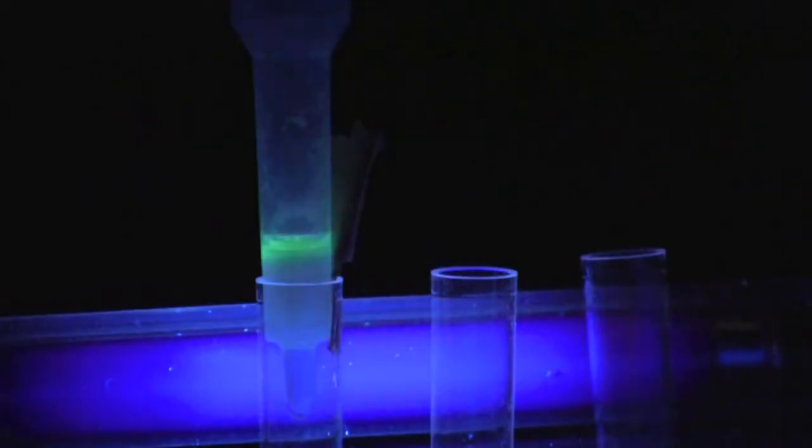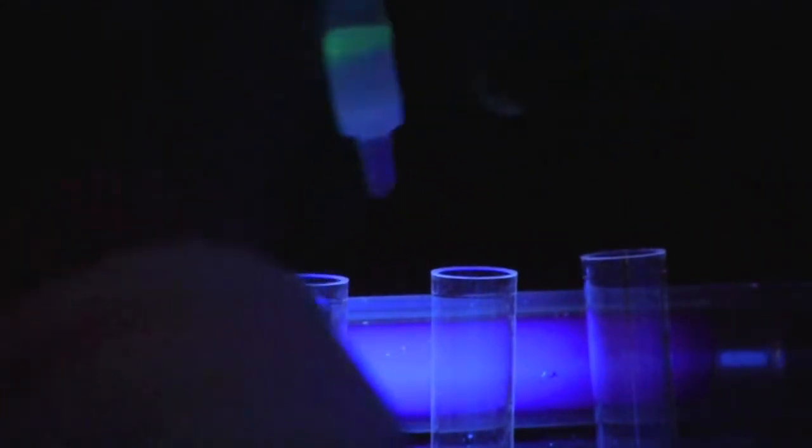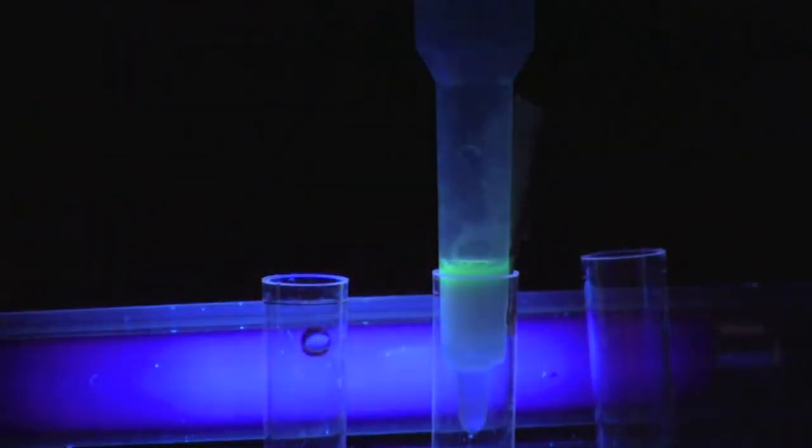At this point, transfer the column to collection tube number 2. The remainder of this activity can be performed in a darkened room with a handheld UV light to increase the visibility of the GFP.